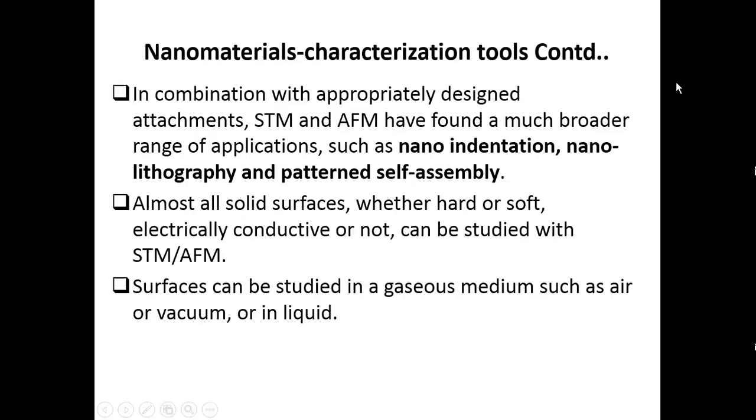In combination with appropriately designed attachments, the scanning tunneling microscope and atomic force microscope have found a much broader range of applications such as nano indentation, nanolithography, and patterned self-assembly. I think you have heard about nanolithography because we have discussed this lithographic technique in the quantum dots formation, isn't it? Also, we have discussed patterned self-assembly. Self-assembly also we have seen in the formation of quantum dots, right?